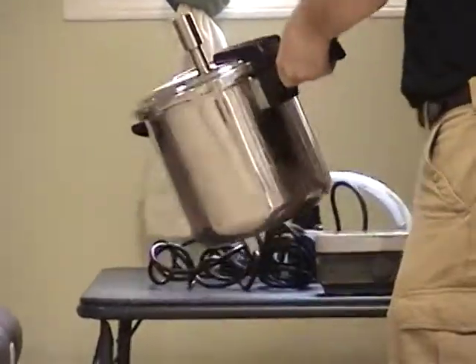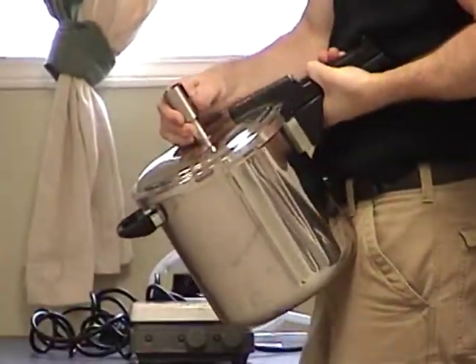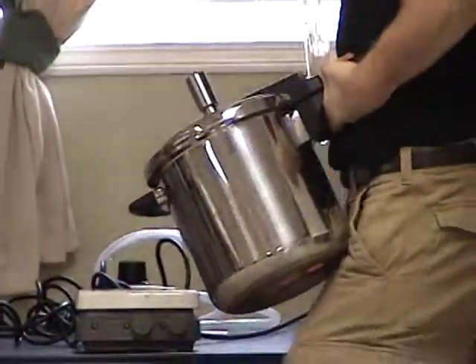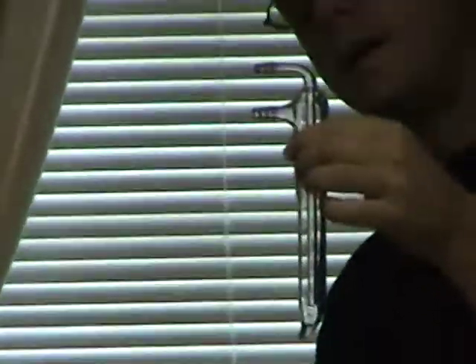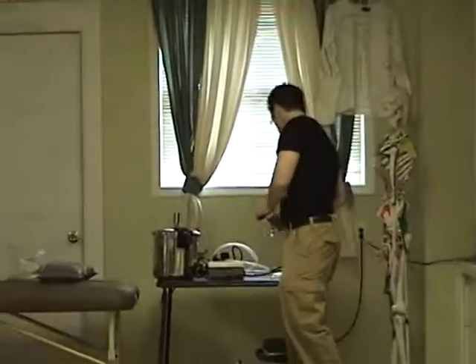This is just an ordinary pressure cooker that I've adapted with this stainless steel fitting to accommodate this lab joint. This is what's called a cold finger condenser, and this is what's going to allow us to get the oil back into the lipid phase after it goes into the gaseous phase, and it can condense back down and drop into the trap.